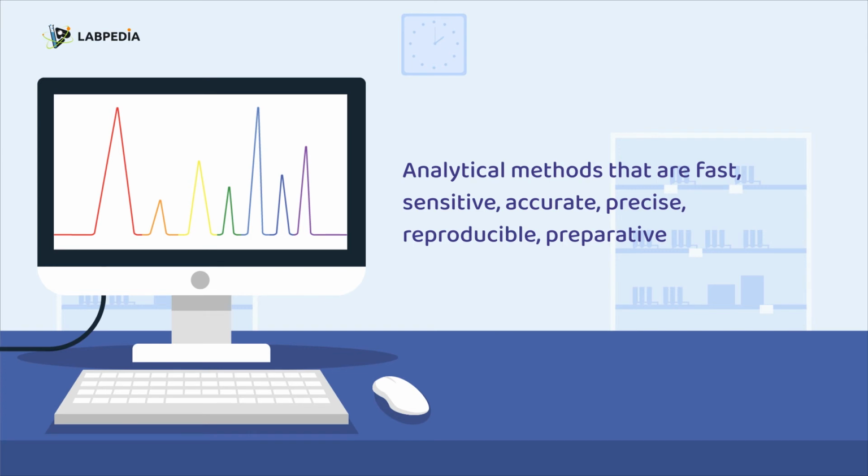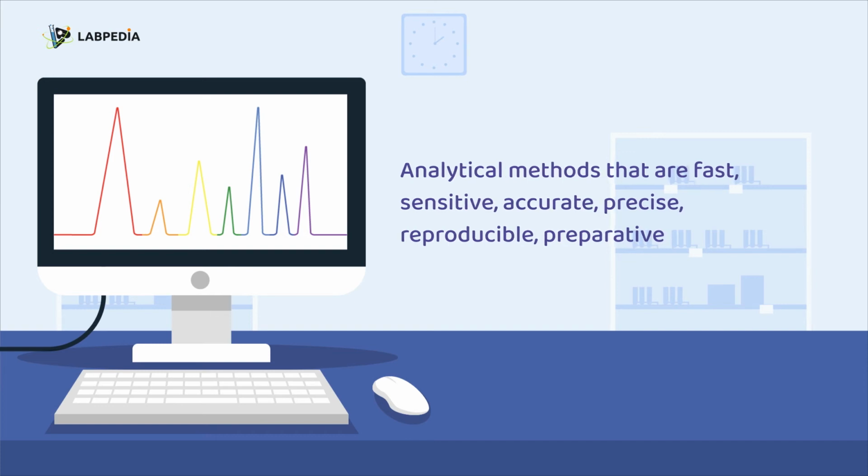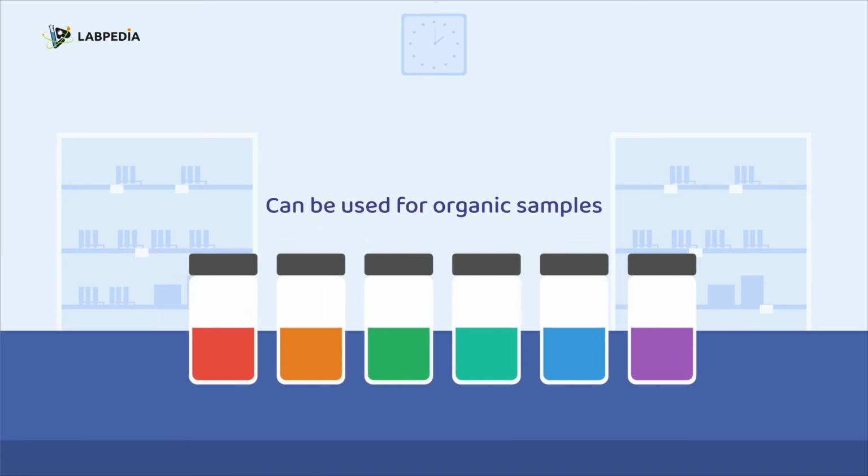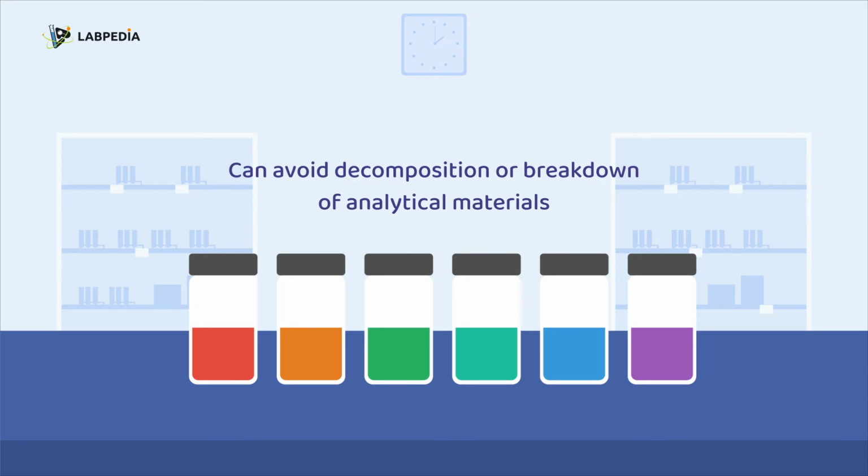Analytical methods that are fast, sensitive, accurate, precise, reproducible, preparative. Can be used for organic samples. Can avoid decomposition or breakdown of analytical materials.